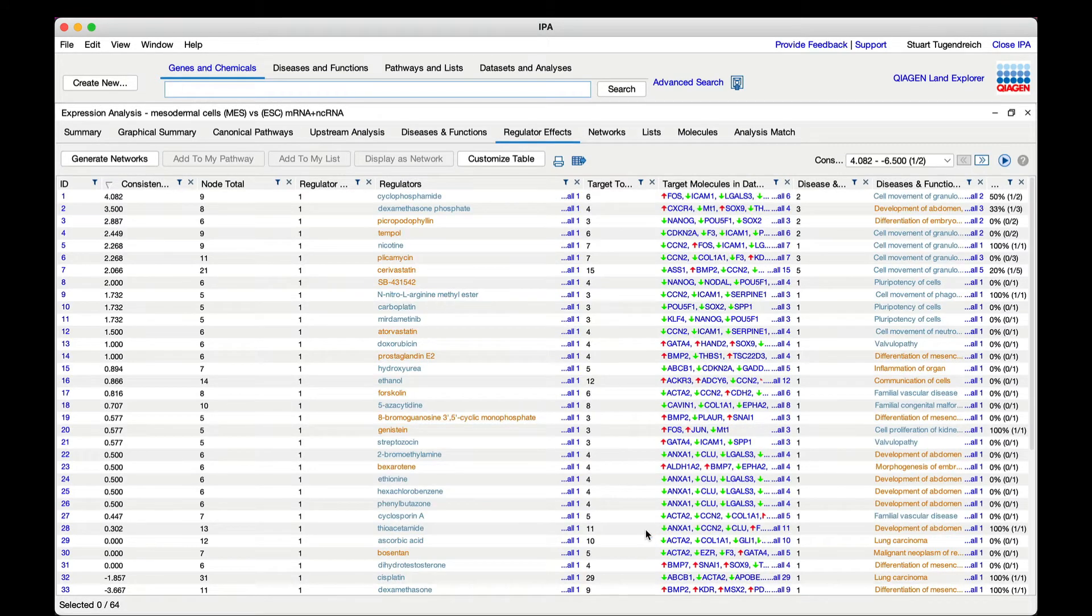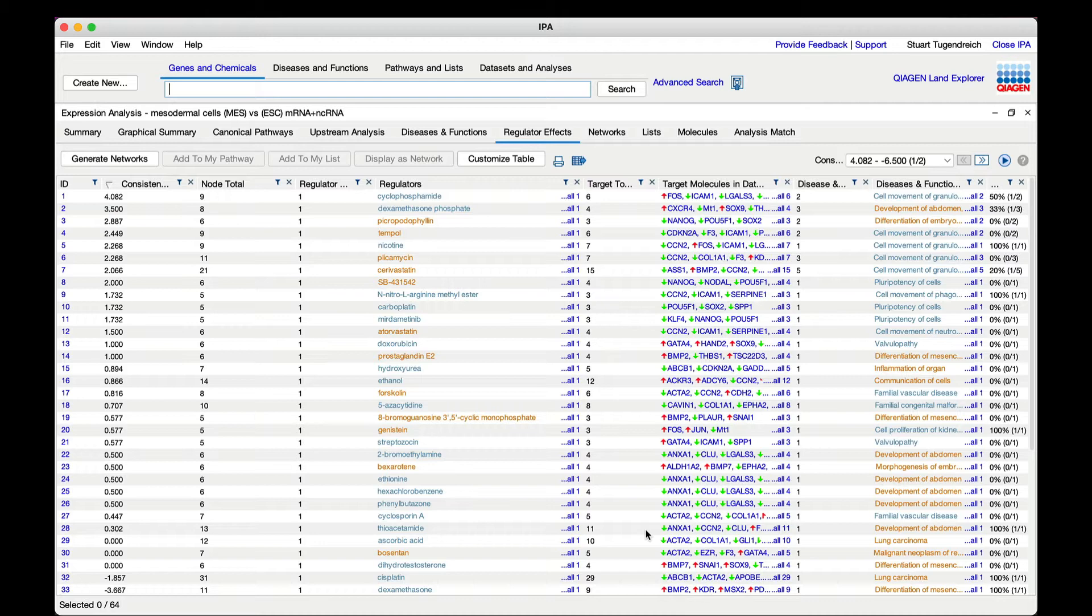The newly generated networks replace any existing regulator effects networks in the analysis. You can always rerun the algorithm with the default settings to restore them.